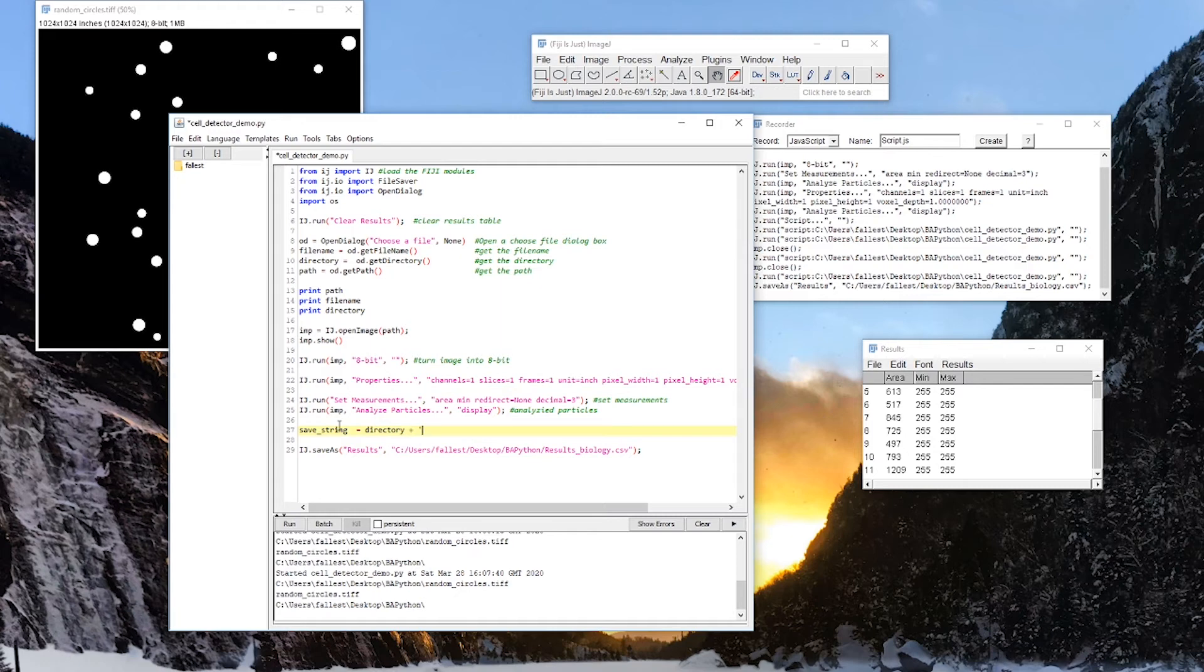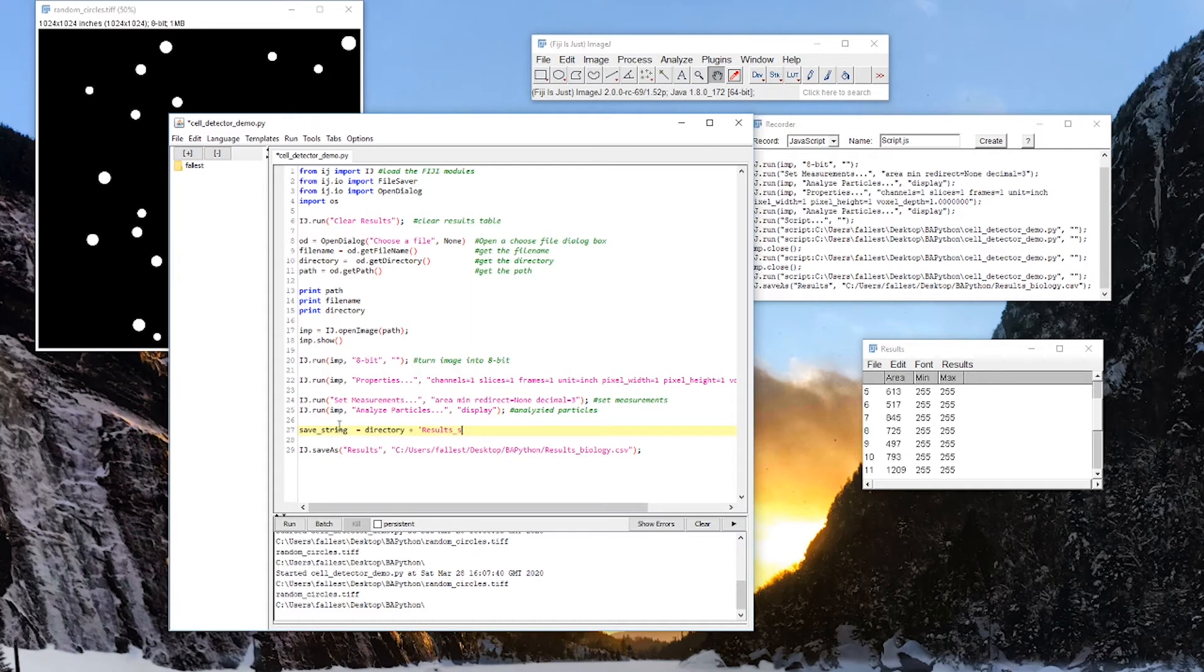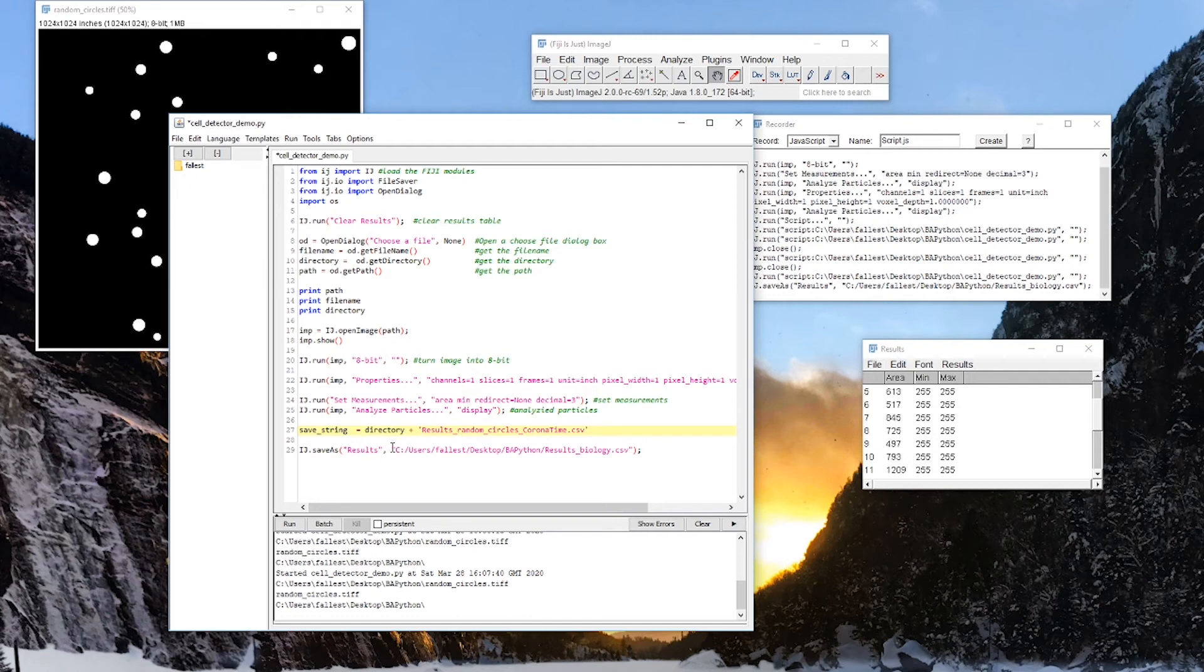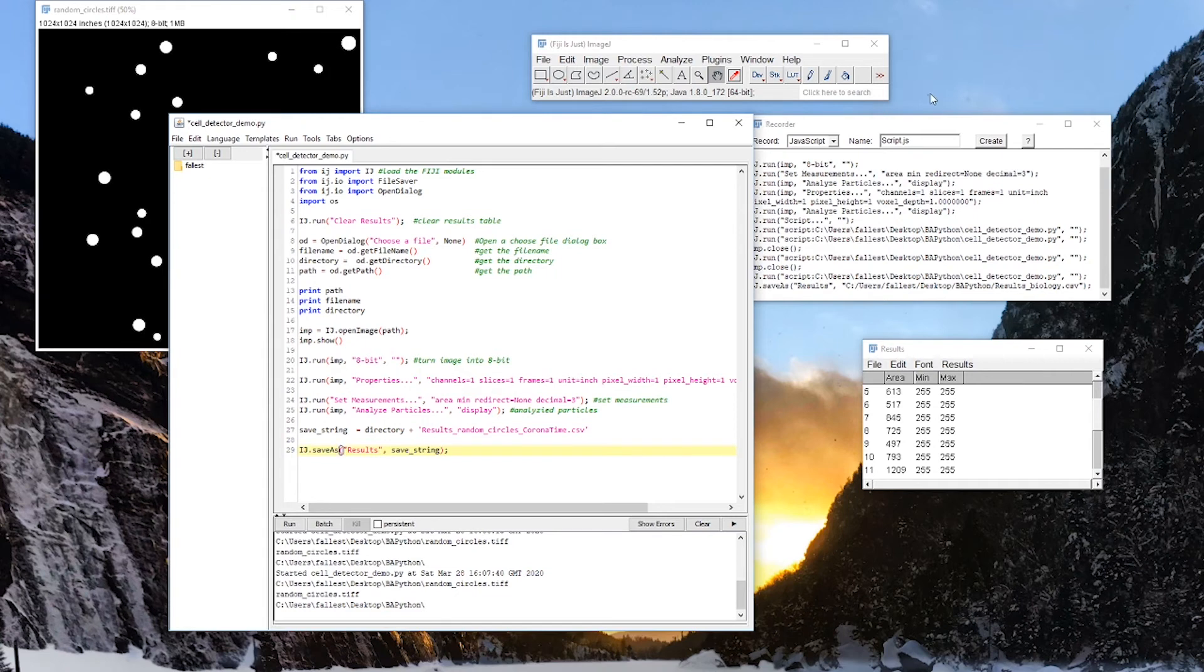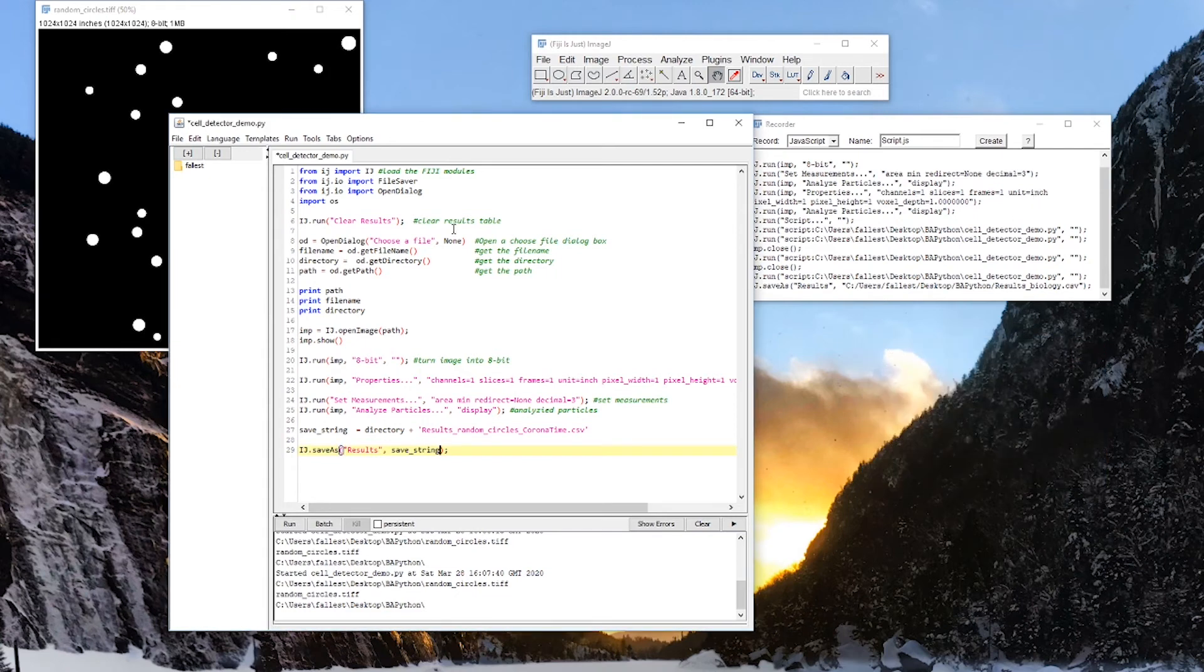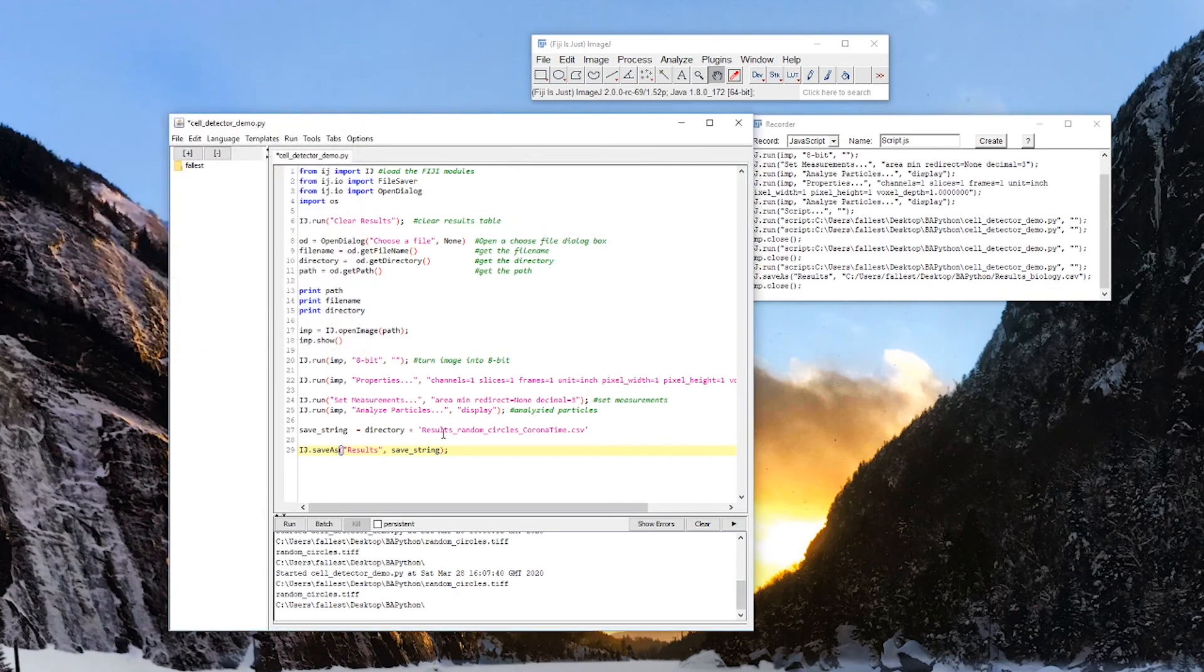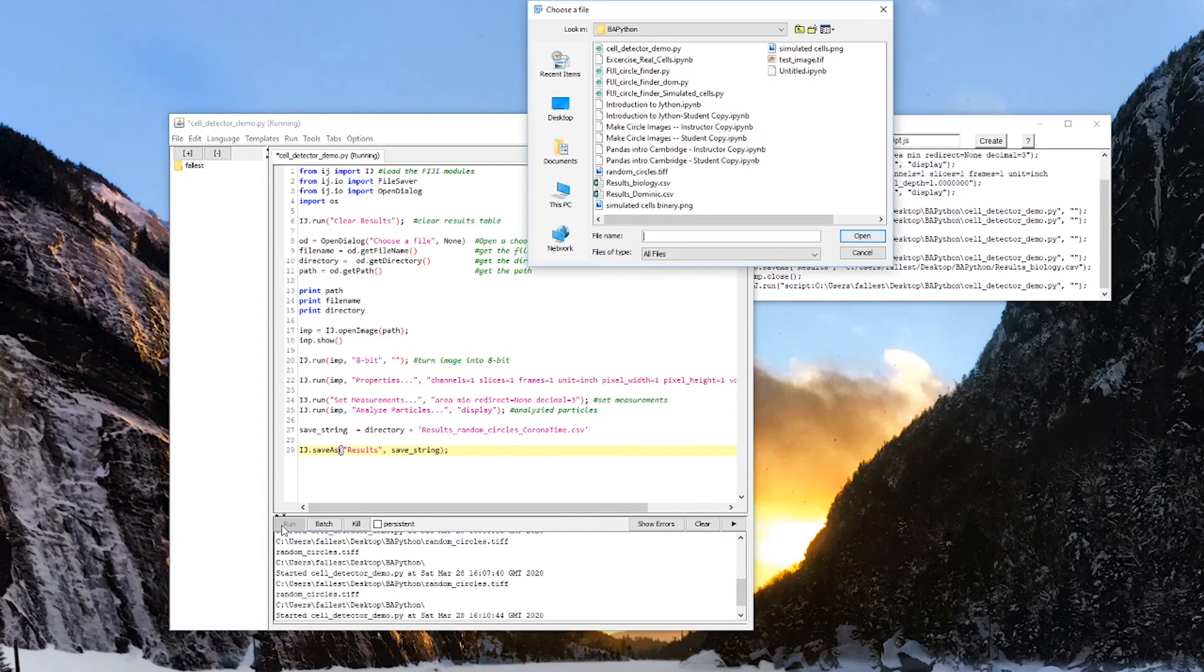Results. Oh, let's spell that correctly. Results. Random circles. Random. Circles. And then. Corona. Time. Dot CSV, because it's going to be a CSV file. And now I can just say, instead of results, comma, this path, results, save string. And let's close this out. Make sure that we're not doing anything in the background. Try it again. Make sure that everything is working. Run.